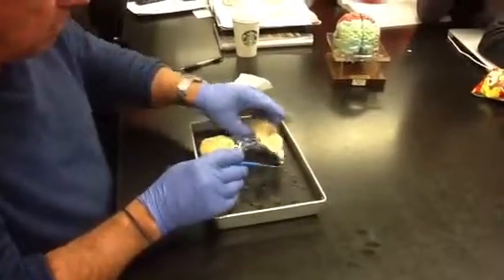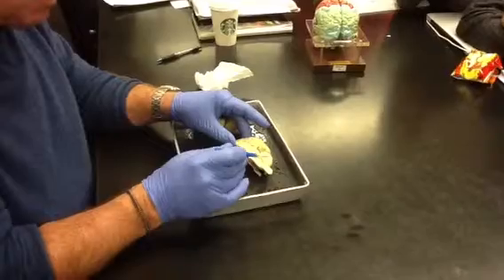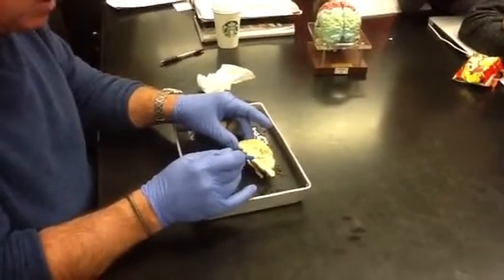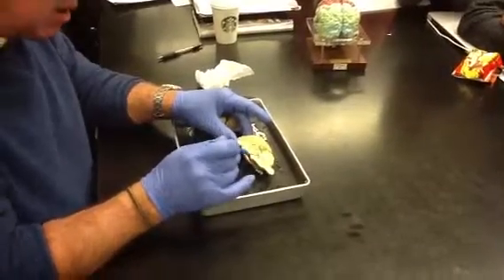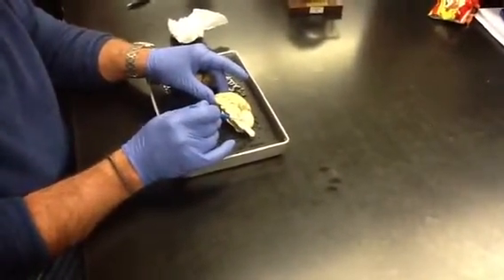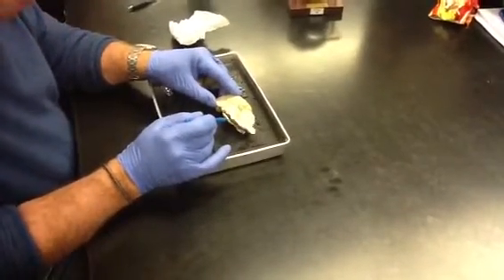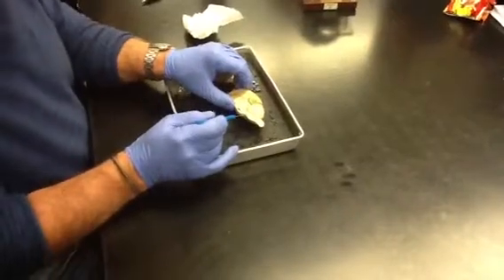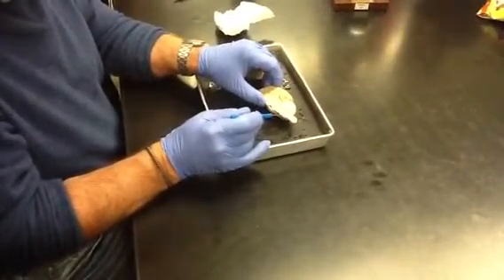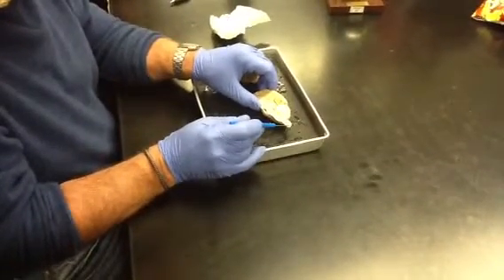Then the half brain looks like this. You can see the cerebellum, this structure here, and the white fibers in it. That's the tree of life. And then a tiny little space right here at the base of the cerebellum is the fourth ventricle. And then this little bulge, not much of a bulge is it, right here is the pons. And then this would be the medulla oblongata, and then probably this is a little bit of the spinal cord.